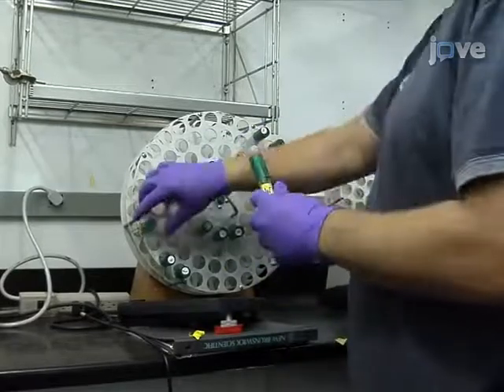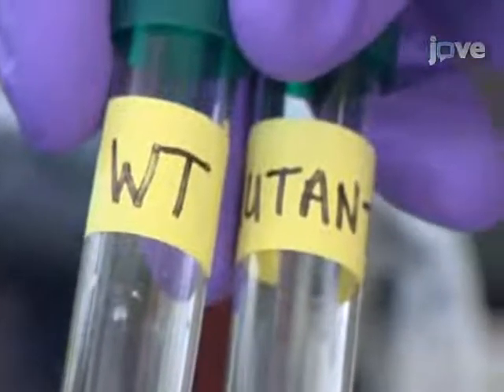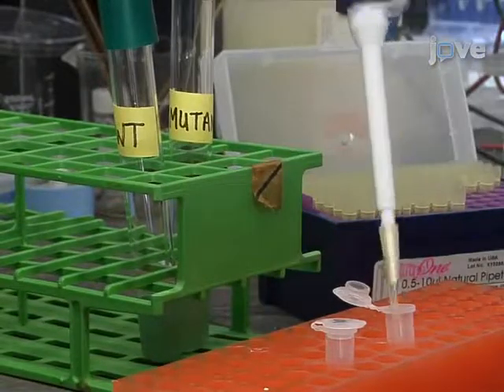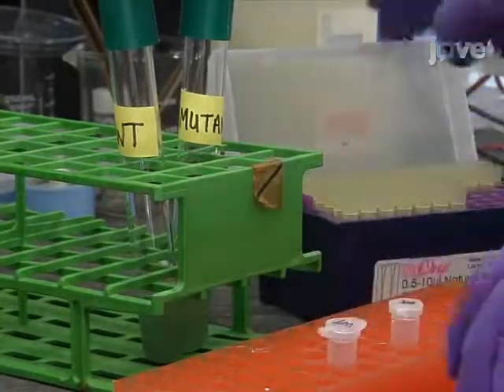Prepare a 5 milliliter overnight culture of the wild type Pseudomonas aeruginosa or mutant strain in LB medium. Dilute 10 microliters of culture into 1 milliliter of fresh M63 minimal medium supplemented with magnesium sulfate, glucose, and casamino acids.